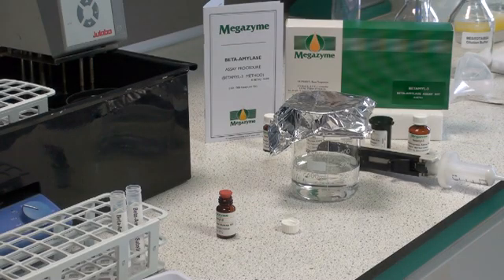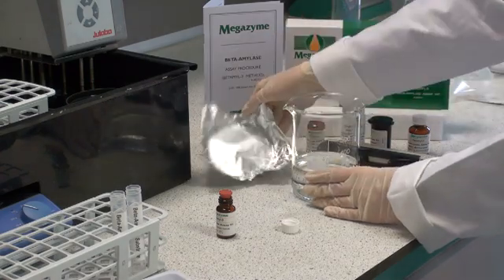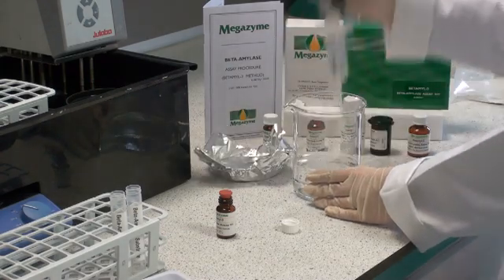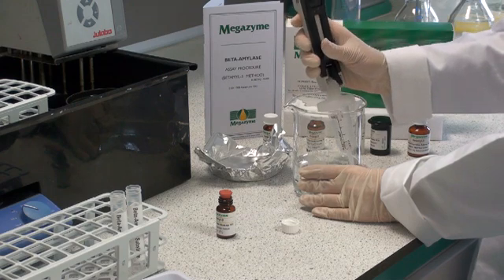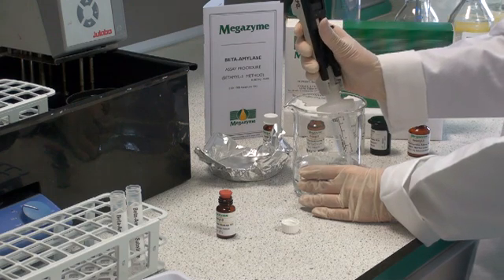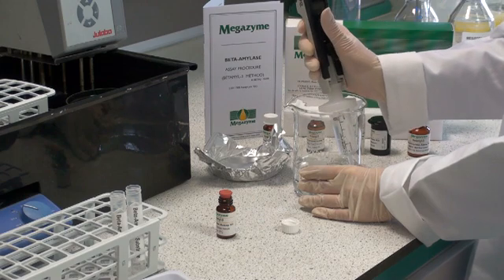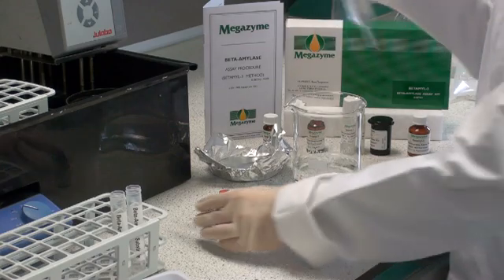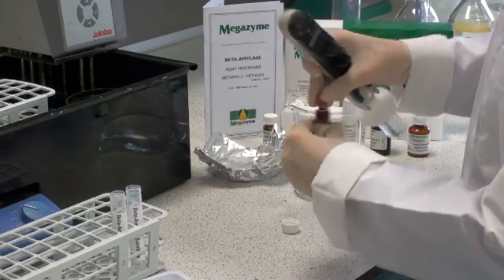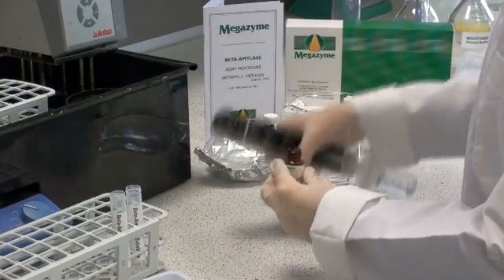Dissolve the contents of one of the vials of beta-amyl-3 reagent with 10ml of boiled and cooled distilled water. This water is prepared by microwaving until the water is boiling and then cooling this on ice to around room temperature. This will inactivate any enzymes likely to be present in the water.